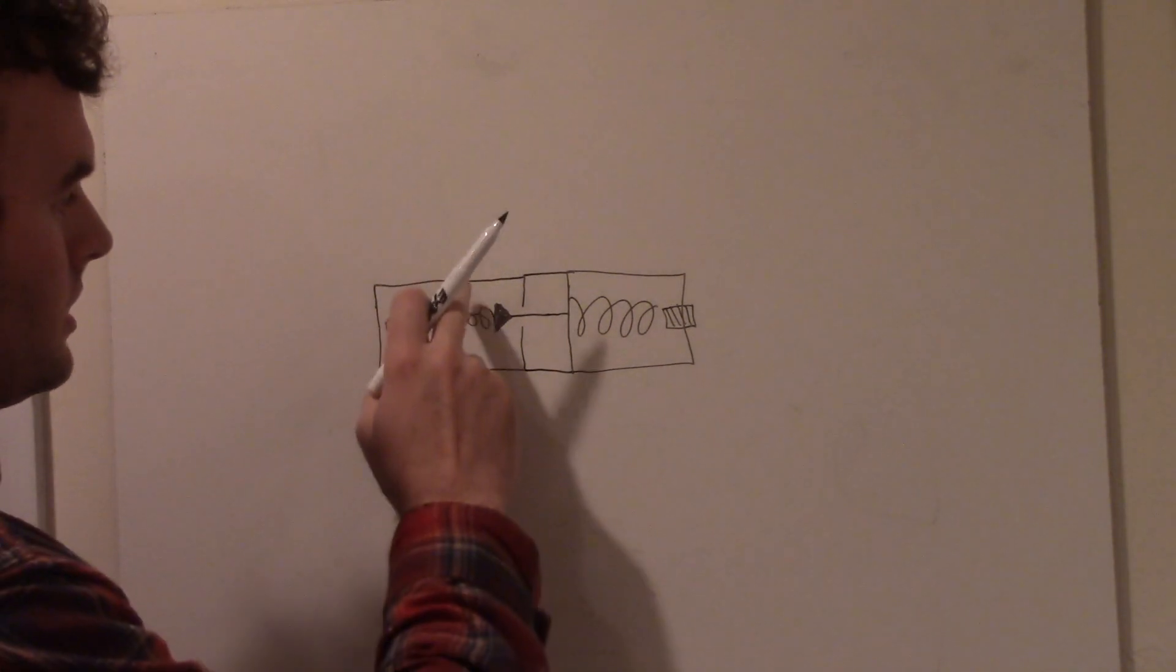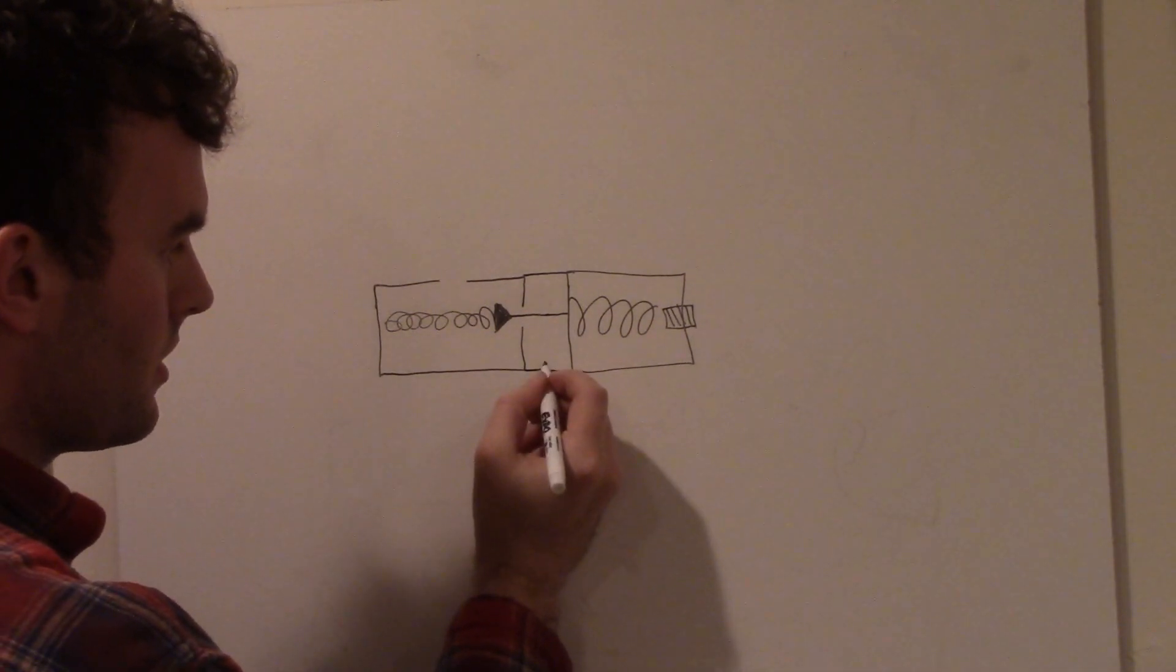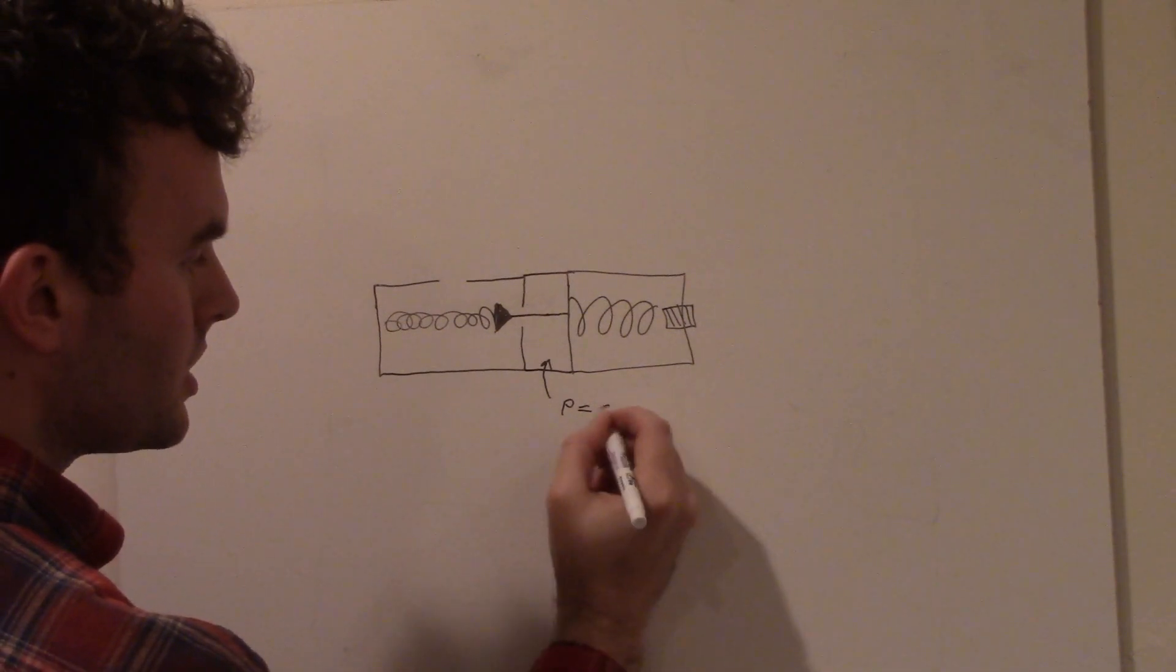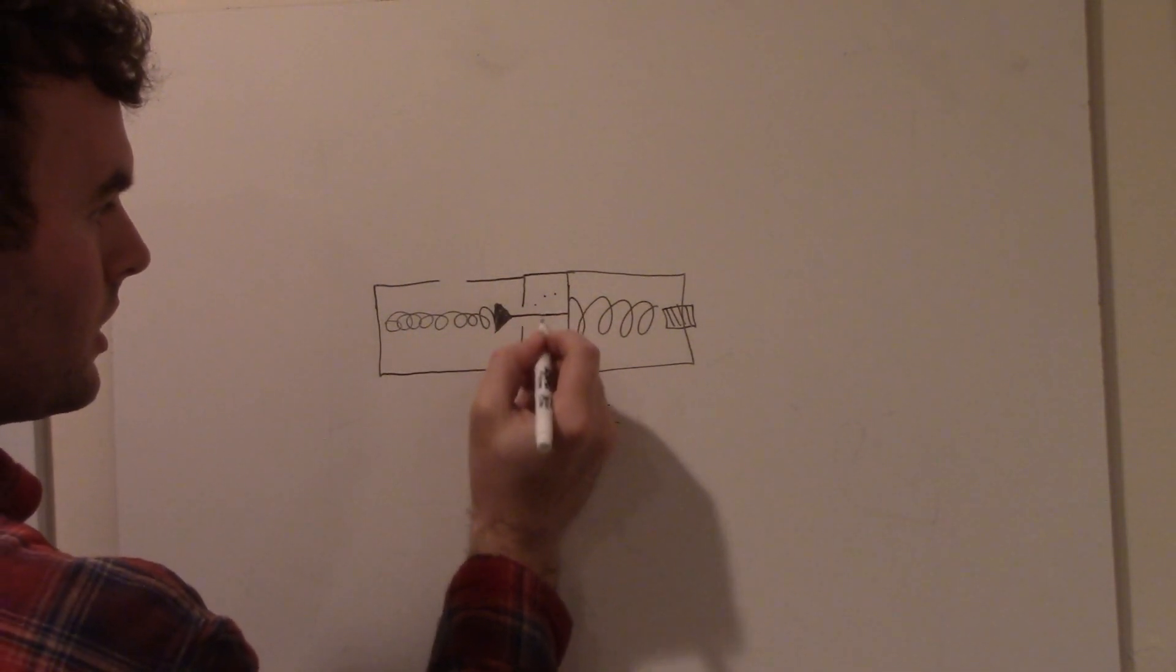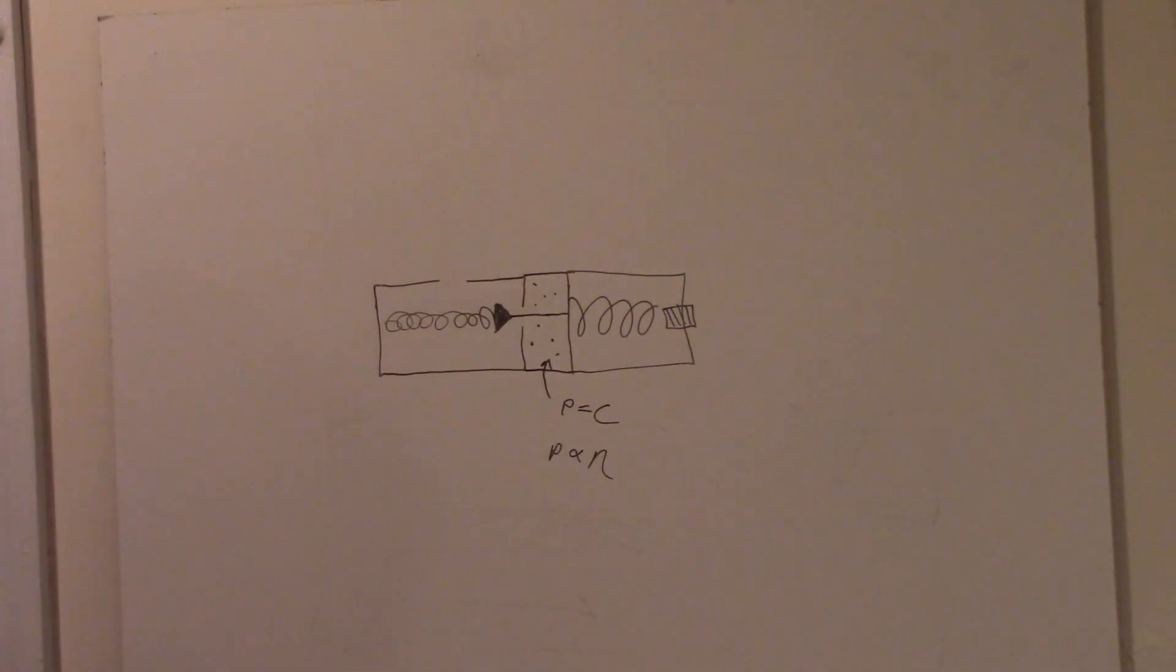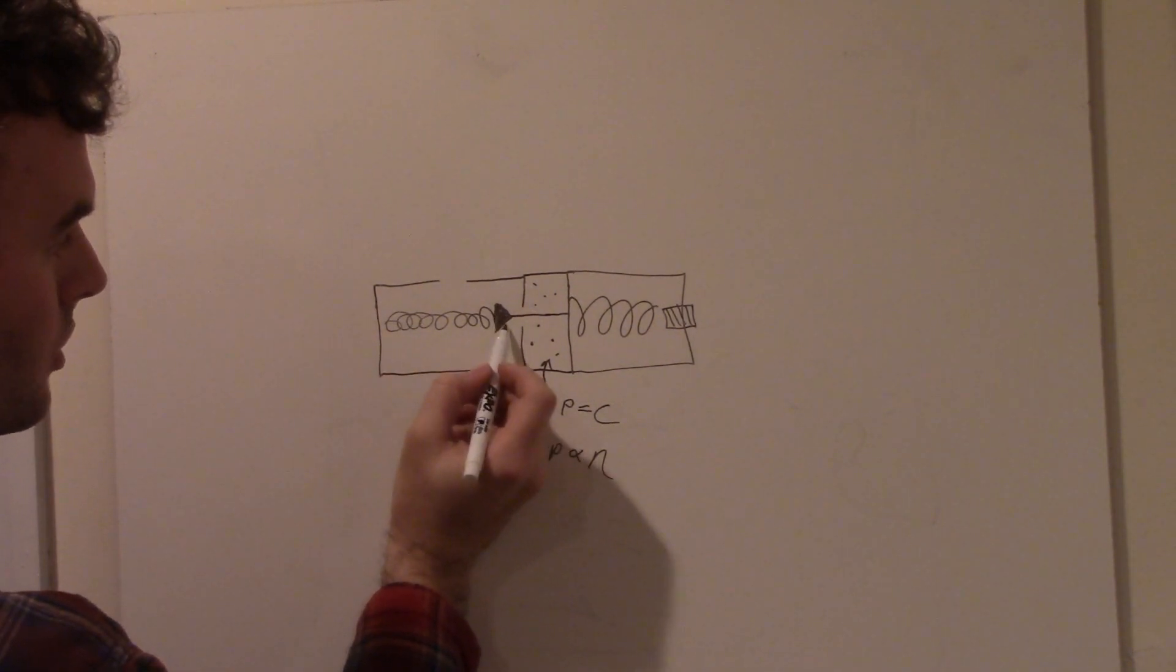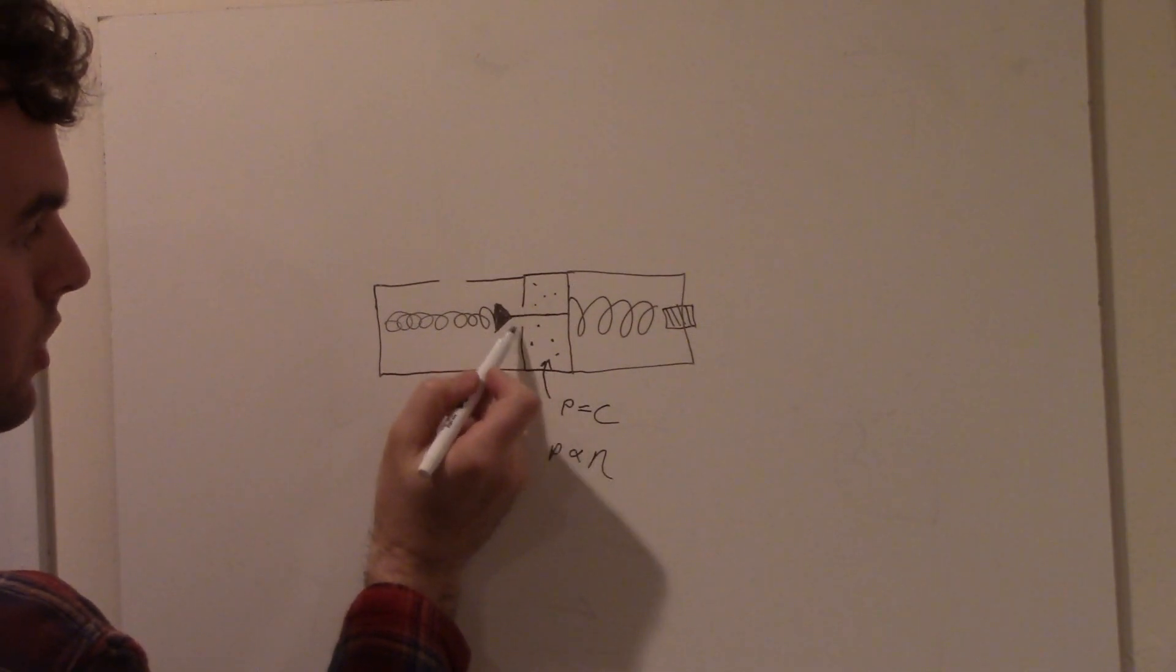So you've almost got one regulator. The first regulator stage actually is here on the back, then the second regulator stage is here on the front. The way that this regulator works is that we have an air holding chamber. What the regulator tries to do is keep the pressure in there equal to some constant you set. Another way to think of that is it tries to keep the number of gas molecules in this chamber pretty constant, because the pressure is proportional to the number of molecules in there.